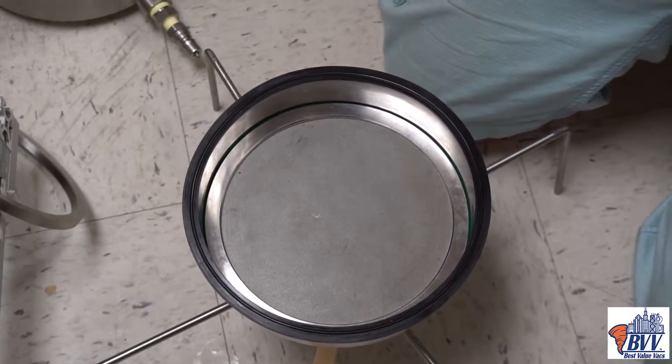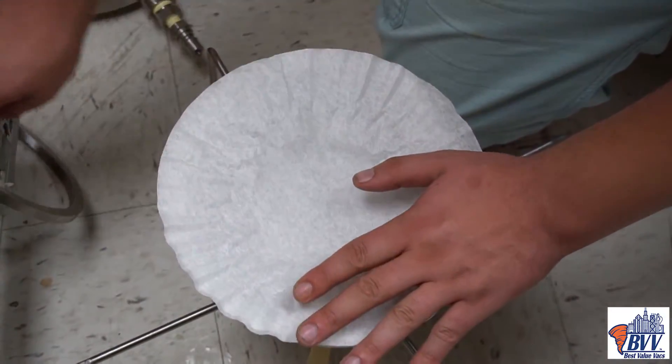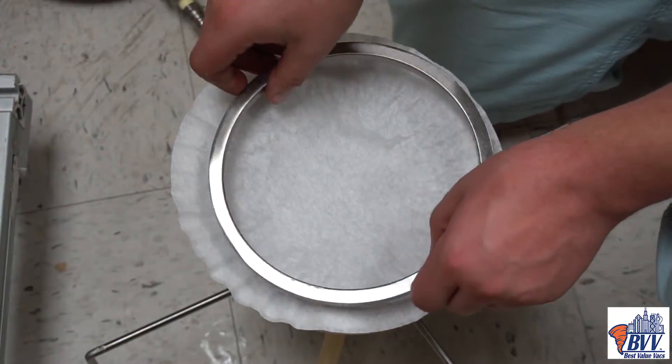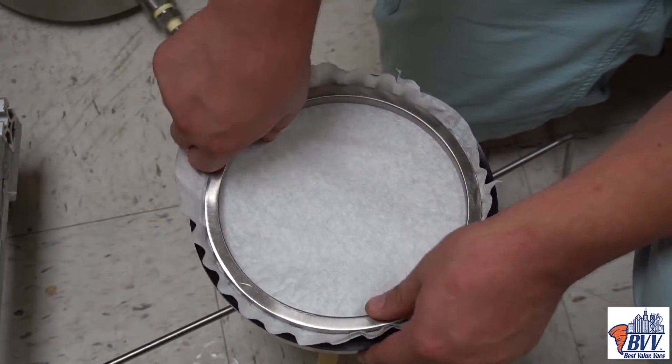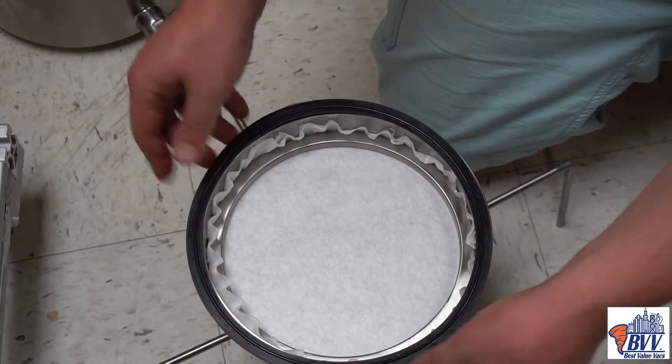It is recommended to use a paper filter over the top of the centered metal disc. This will prevent as much clogging as possible and give more longevity on the filter disc before cleaning.